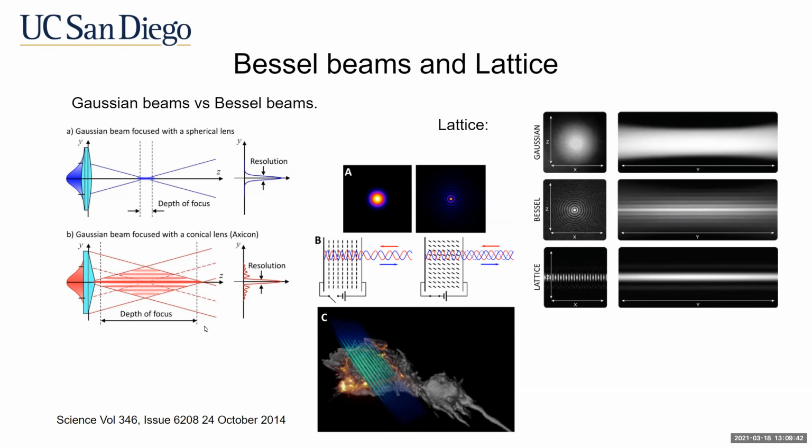The lattice modifies the beam with the SLM, which allows ultra thin lattice beams by changing the waveform and introducing a structured pattern. The resulting light pattern is filtered and uses destructive interference to reduce the intensity of the outer circles of the Bessel light sheet, resulting in a patterned light sheet that is non-diffractive.